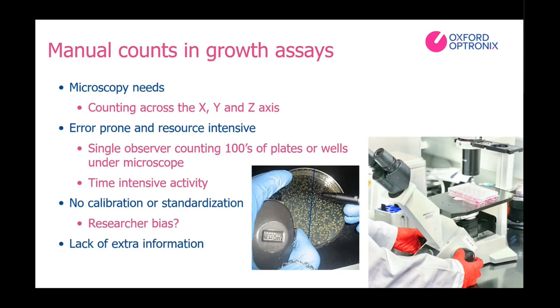Moreover, manual counts can be further compromised, either wittingly or unwittingly, by the bias of a researcher whose expectations about the outcome of an experiment impact their counts. The use of bright field microscopy to visually count organoids offers a major problem for researchers, which is it is often difficult to determine the acceptable organoid size across different samples.